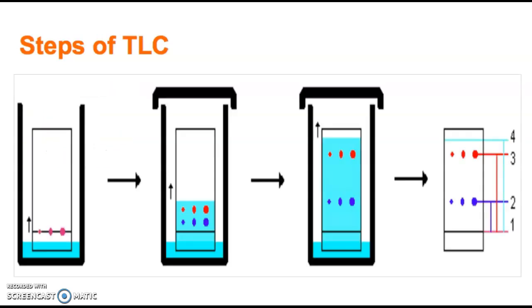And then this is an overview of the steps. Equally distant, after about 5 minutes, the analyte is going to rise, and then after about another 5 minutes, they're separating further, they keep rising, and then the end result.